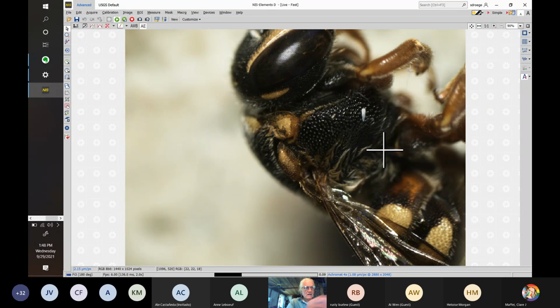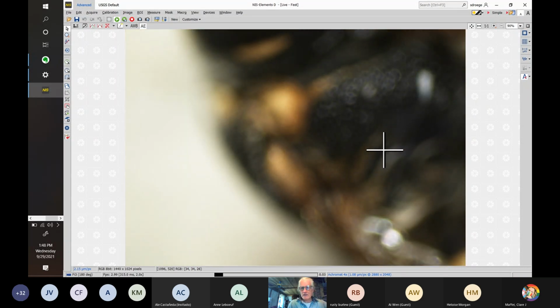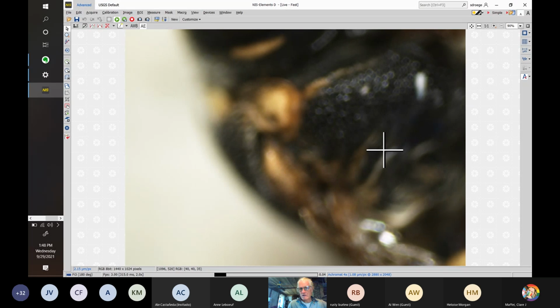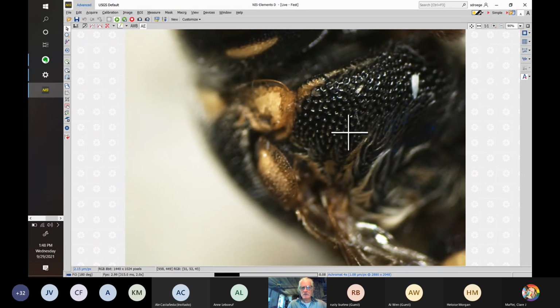So I think here you can see the raised line a little bit better than on the other side, and a bit more of the transition between the two. Big tegula, clear on the edge, the raised angle to the pronotal collar, clear on the edge. This is the, oh, you might be able to see this quite well here. This is the cliff-like raised portion.